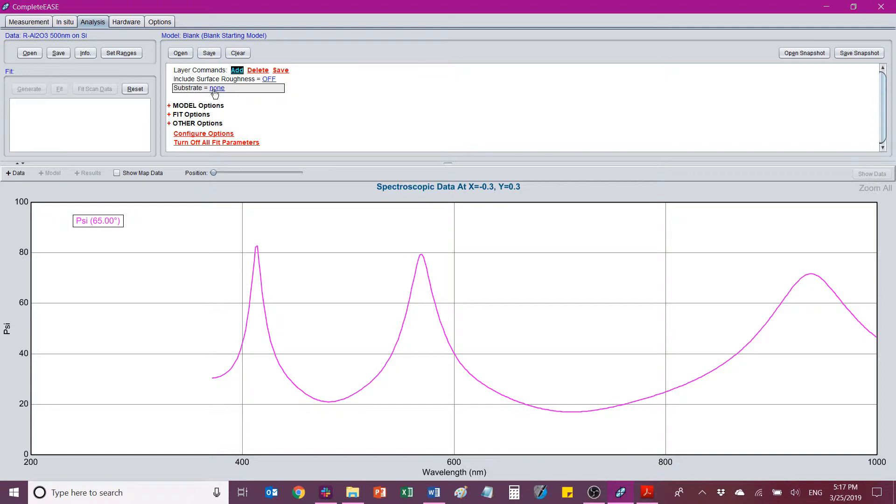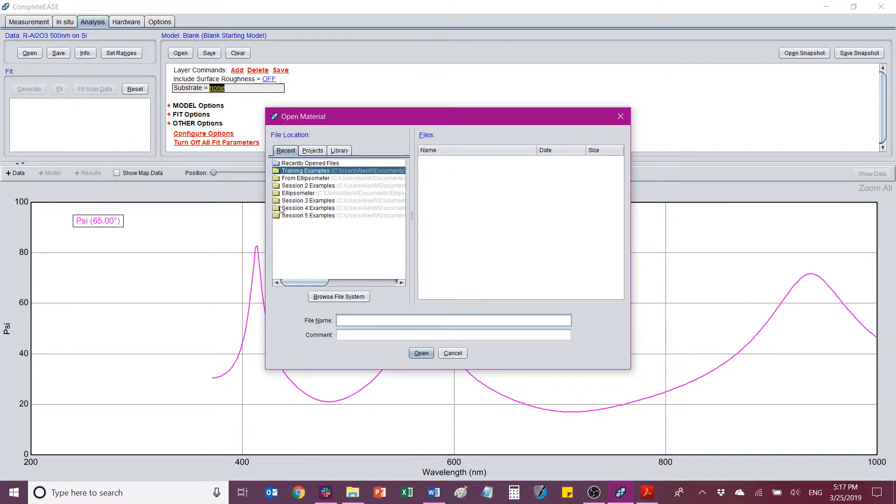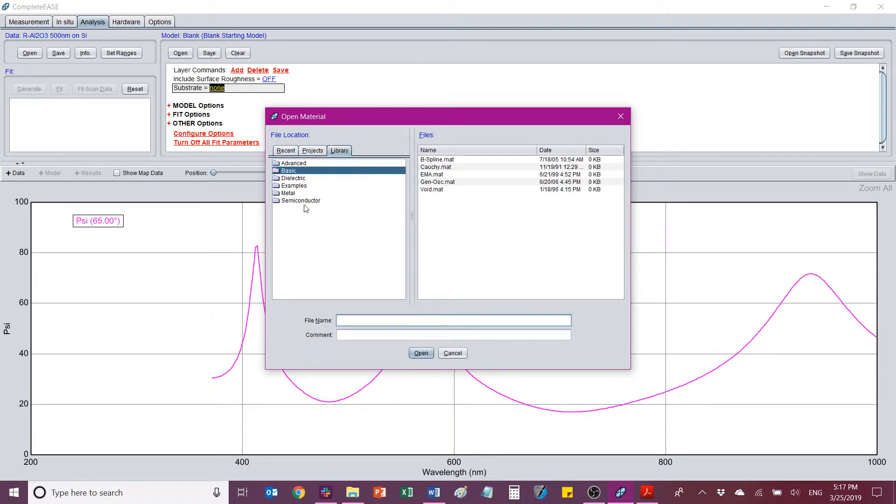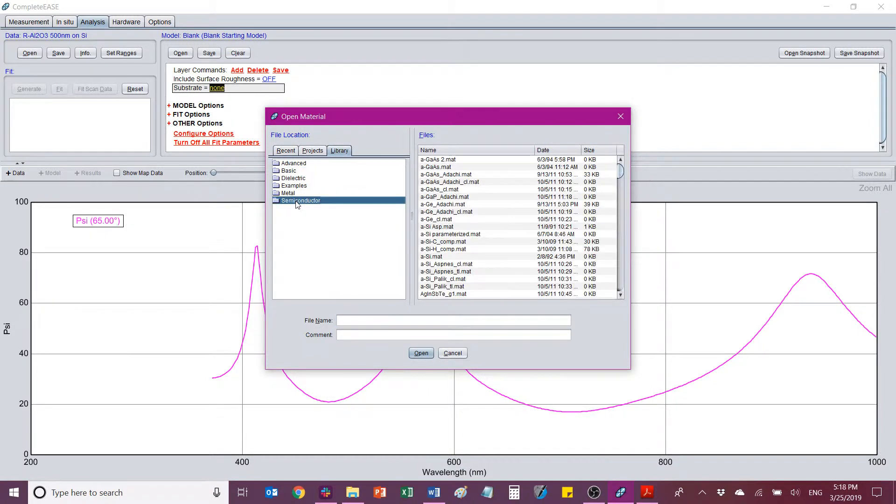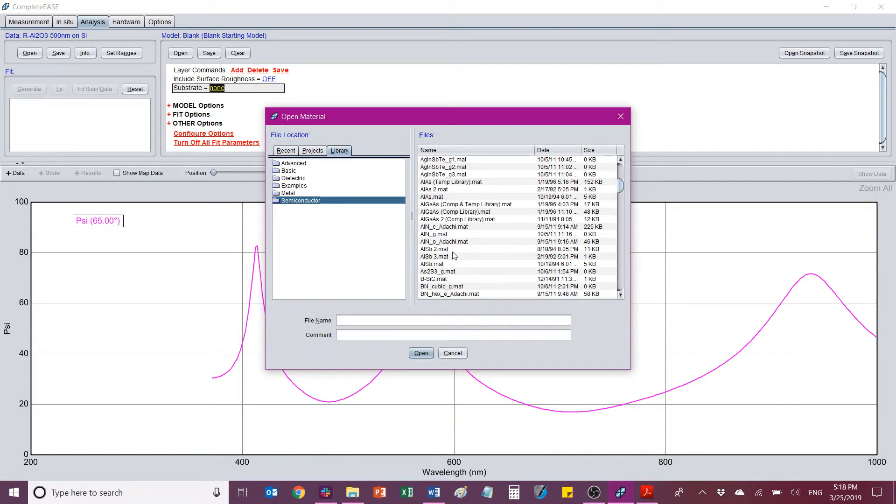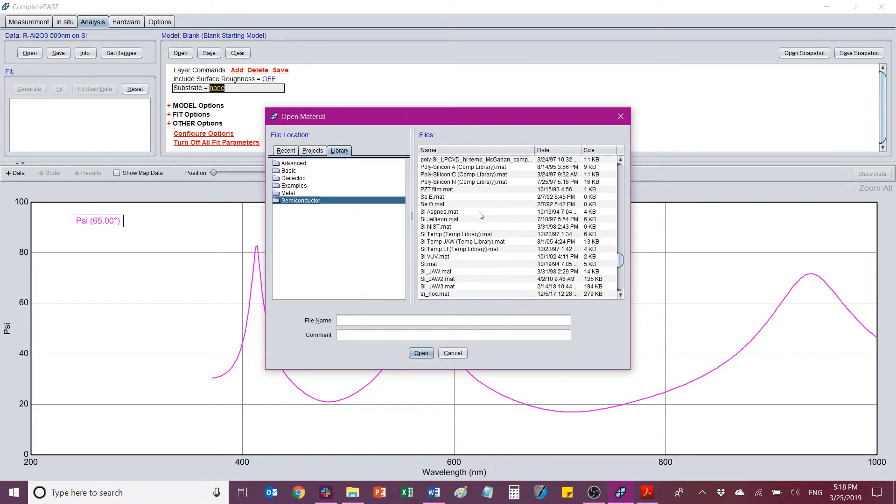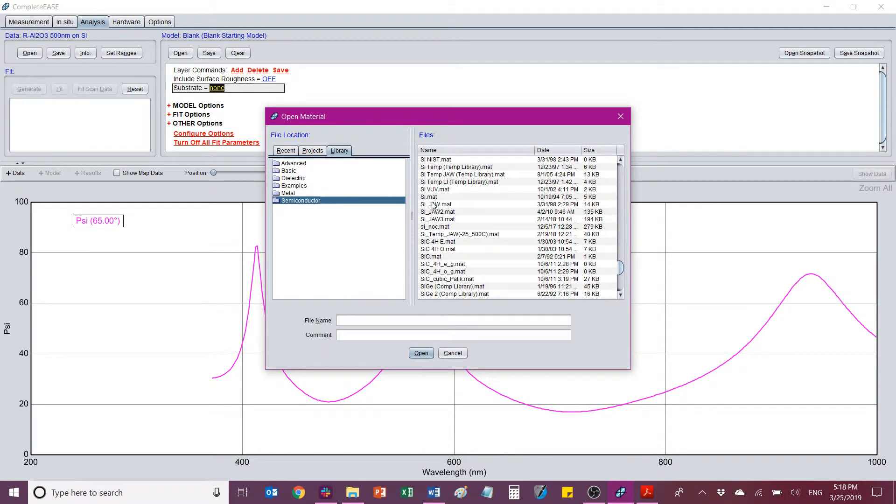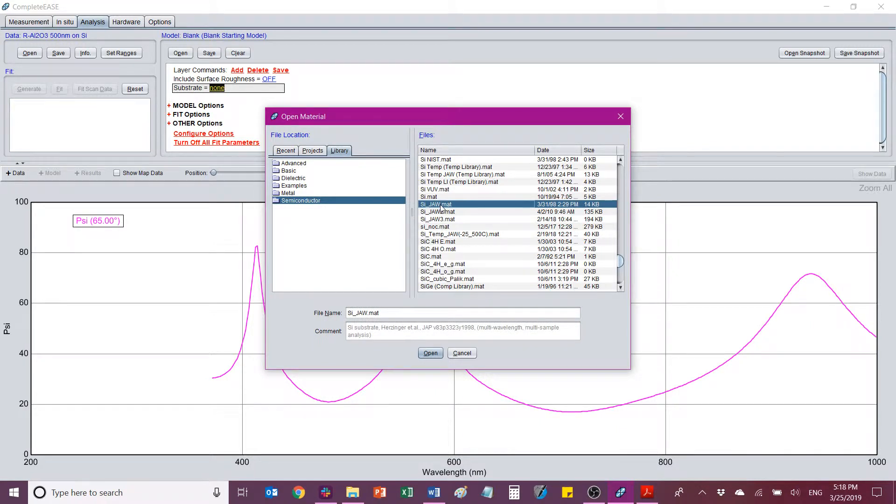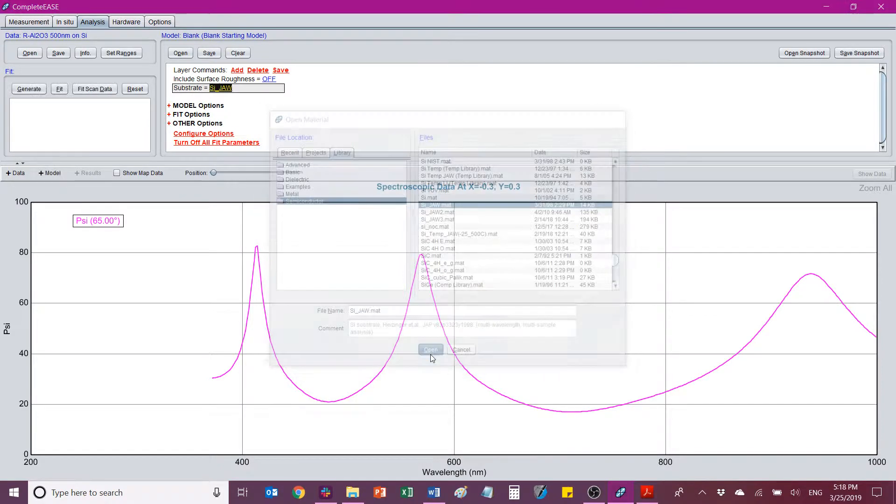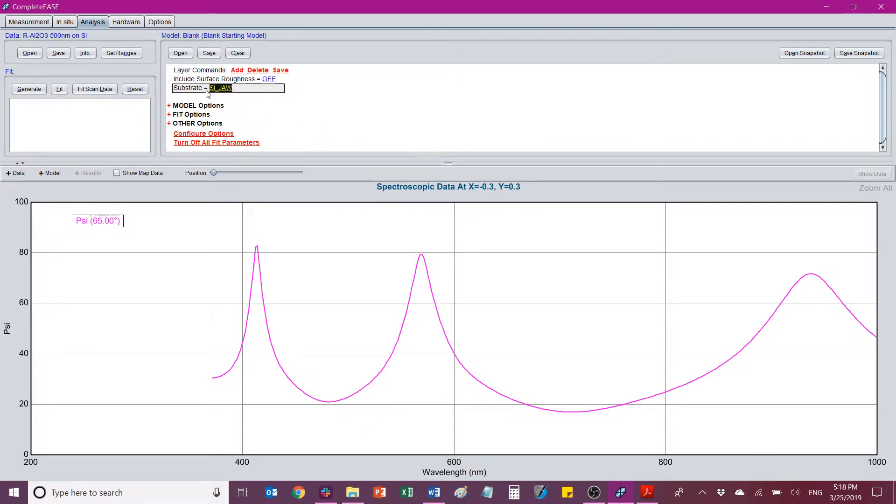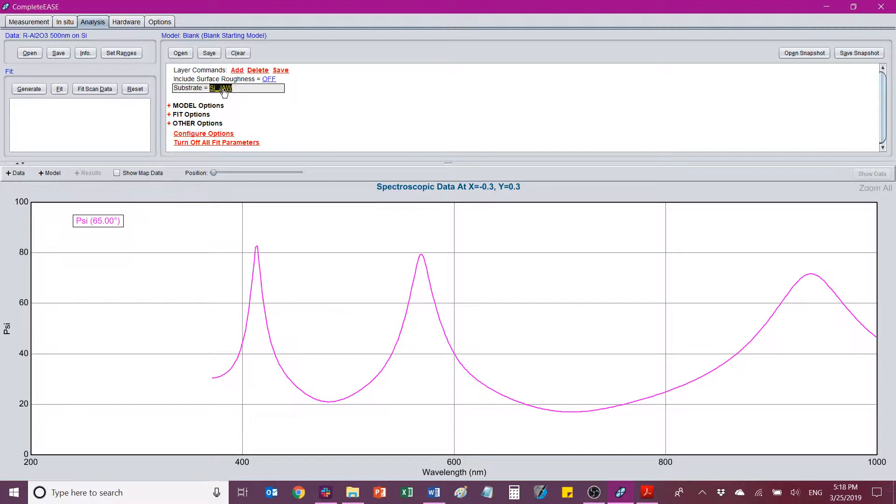So first, I'm going to start by defining my substrate. I'll click this None right here, and then I can change it to something other than None. So we'll go to Library, Semiconductor, and I'm going to go down and I'm going to find this Silicon JAW. Anytime you see a JAW, that's a JA Willem standard. So they generally are pretty good files to use. Alright, so now my substrate is Silicon JA Willem. I would like to point out this is a tabulated data file. Basically what that means is that you don't have the ability to fit anything other than, let's say, the thickness. Now in the case of it being the substrate, we don't fit the thickness because it's just assumed to be infinitely thick in this case. But we will take a look at this in a second with the film that's grown on top.